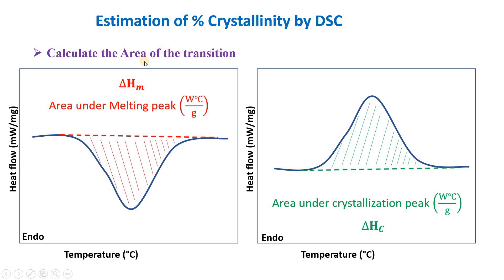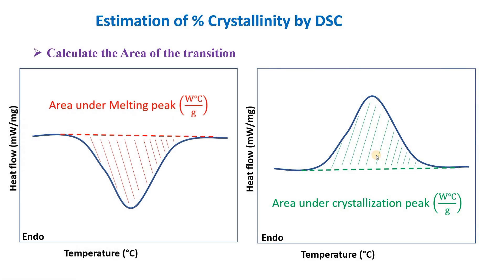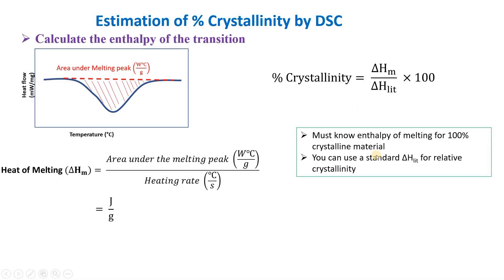The first step to calculate percentage crystallinity by DSC is to calculate the area of the transition. If we have a melting curve, we calculate the area of the melting peak; if we have a crystalline peak, we calculate the area of the crystalline peak. The next step is to calculate the enthalpy of transition. For a melting curve, we divide the area of the melting peak by the heating rate used during DSC.